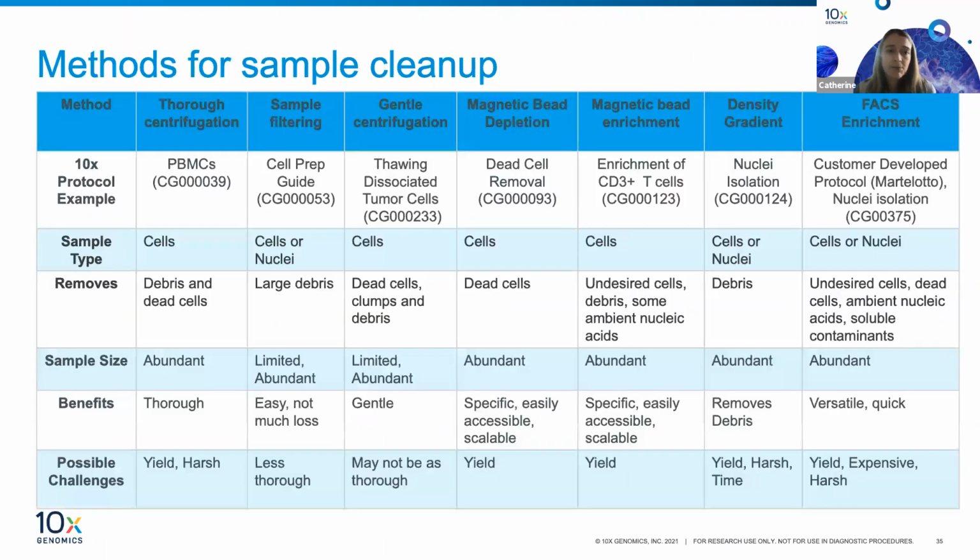So here's a table that just lists some common methods for sample cleanup and enrichment. This by no means is all the methods that you could use. It's just some examples of methods that we have used in-house in our demonstrated protocols. You'll see all the methods across the top, and on the second row, you'll see in which demonstrated protocol these methods were used.